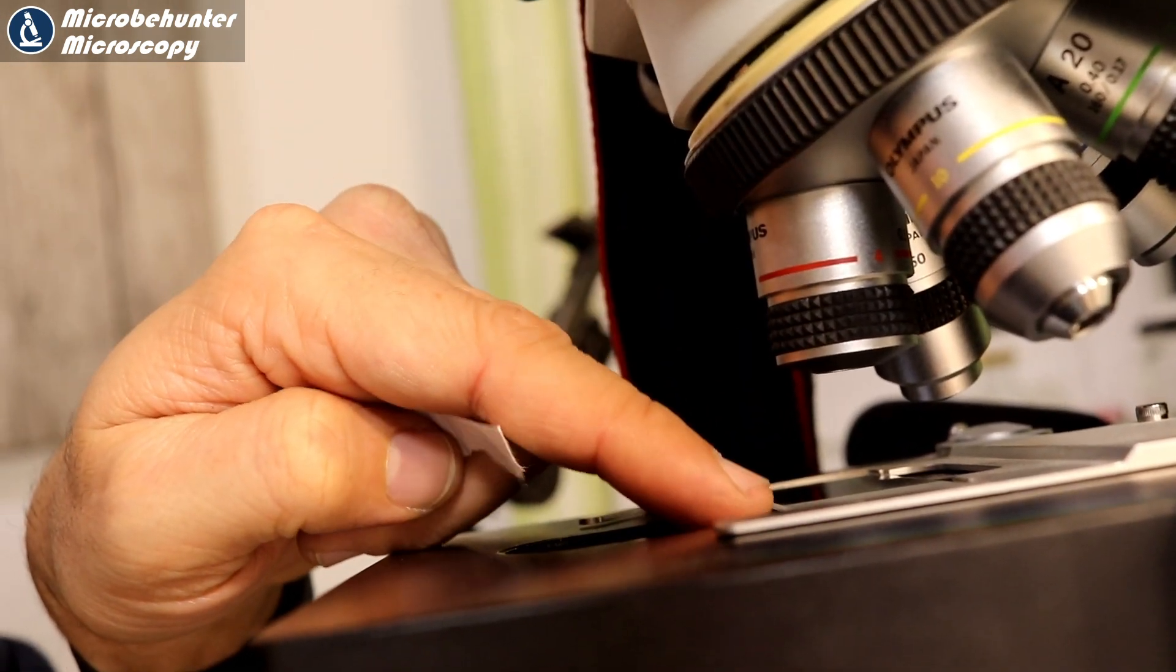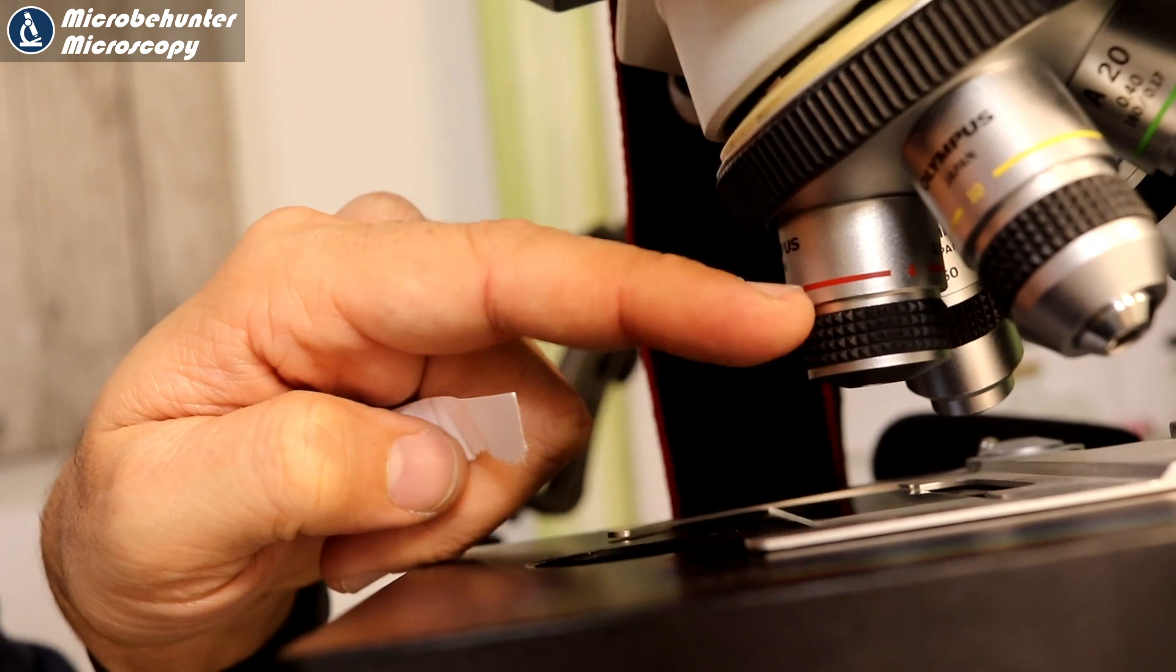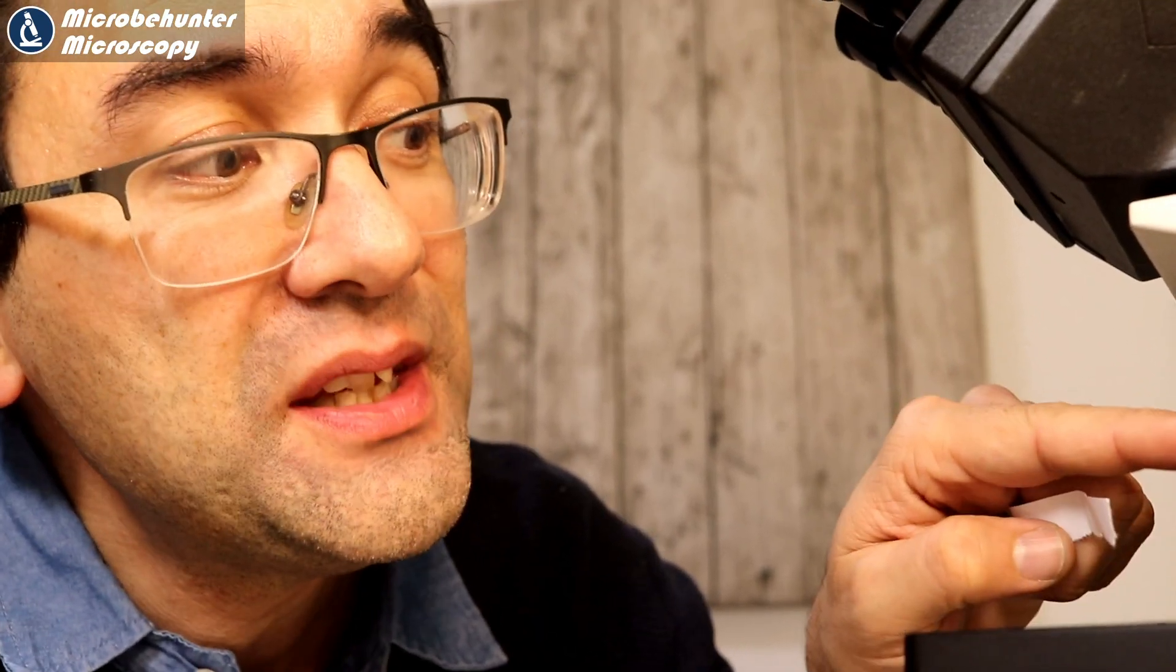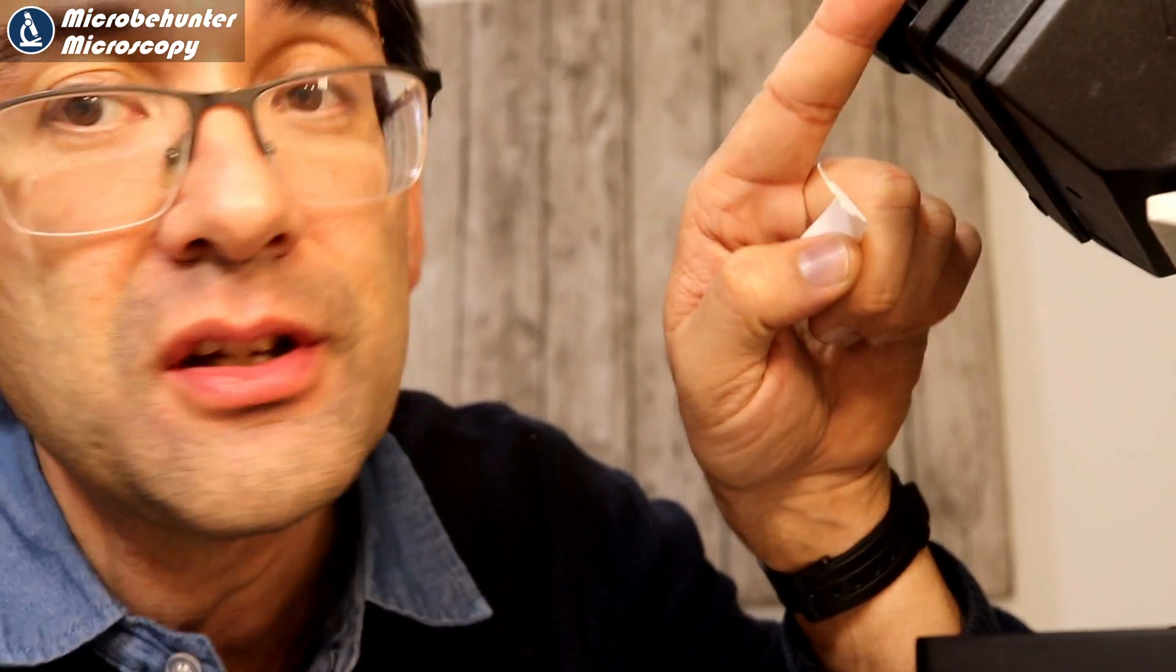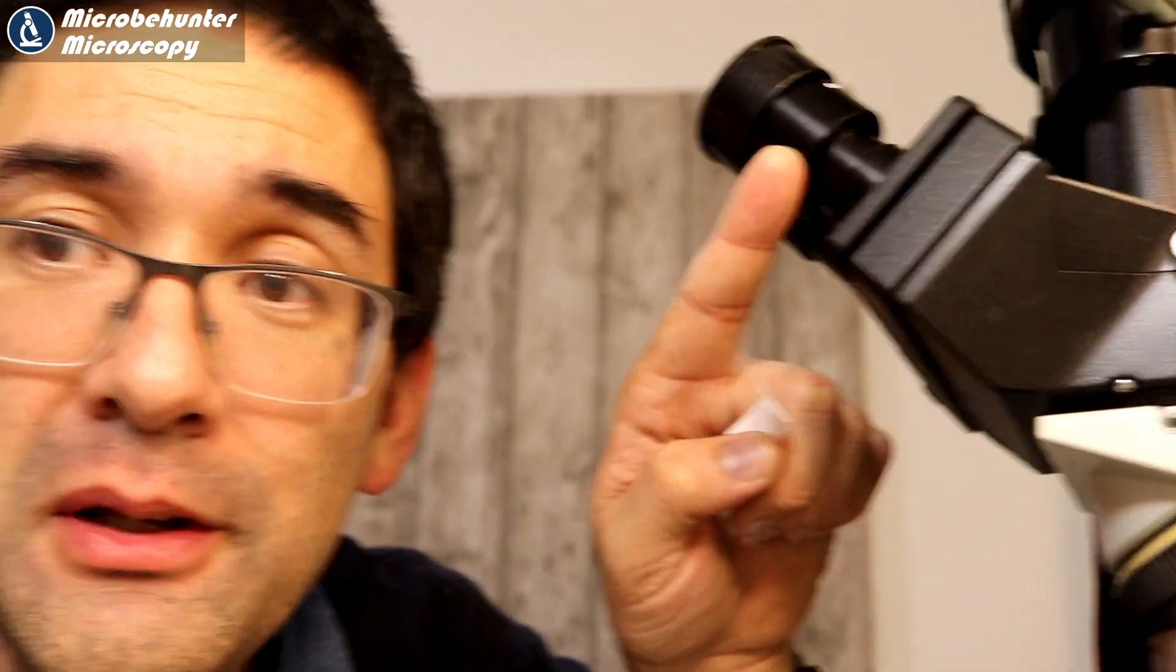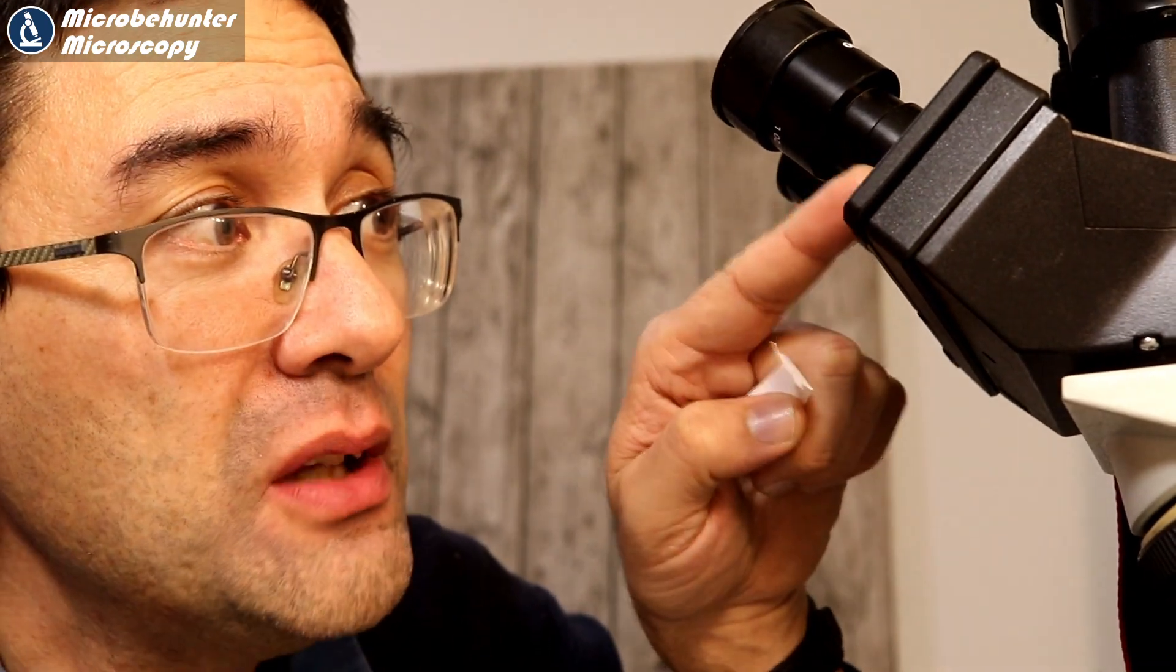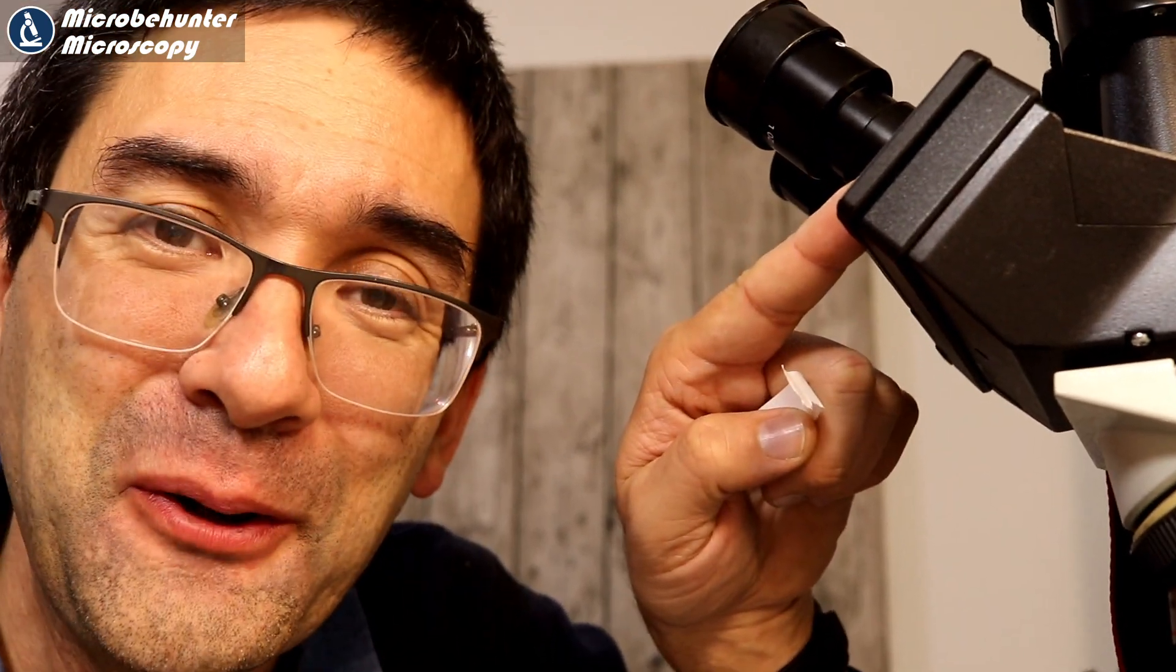If this distance is 45 millimeters, then you have a conjugate distance of 195. Why is this? 45 millimeters plus the 160 millimeters of the 160 millimeter standard, minus the 10 millimeters because the image is projected 10 millimeters down here. This gives you 195. So I've got a conjugate distance of 195 millimeters.